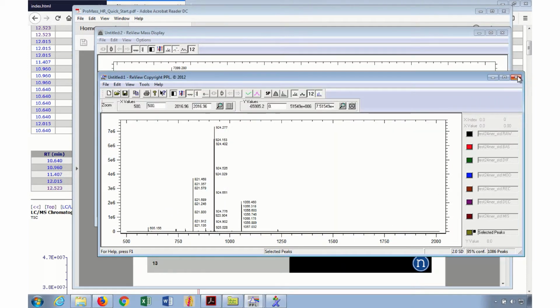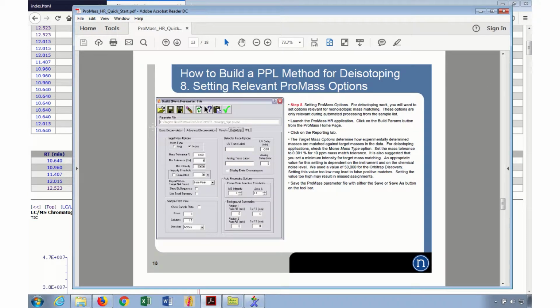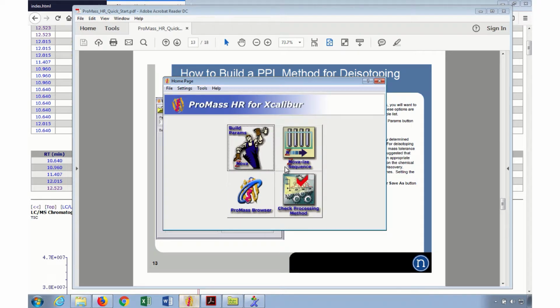If you save that, if I close this now and then I decide later, oh, I really need to change the molecular formula a little bit to work with the S oligos versus non-S oligos. If I didn't save that, I would have to go through the whole process of modeling the peaks and everything.